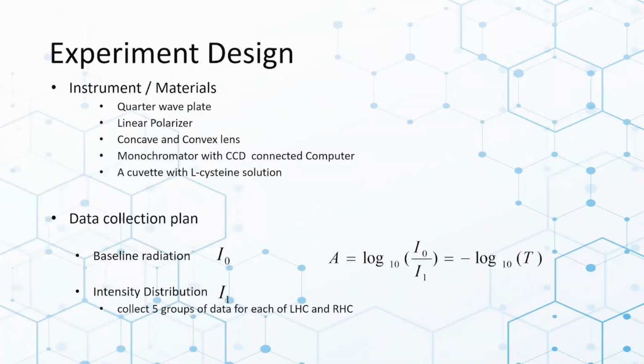About our experiment design, we use a quarter wave plate, a linear polarizer, concave and convex lenses, a monochromator with a CCD camera connected to a computer, and a cuvette with L-cysteine solution as our instruments and materials.